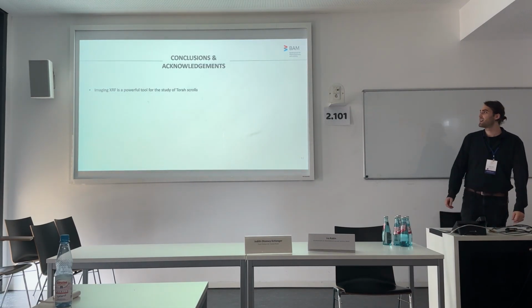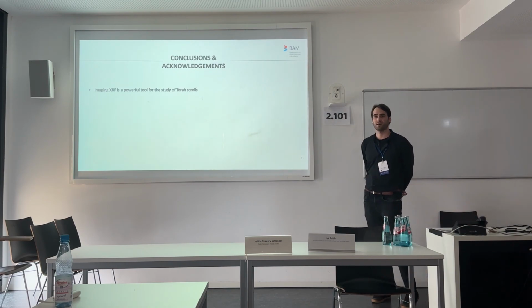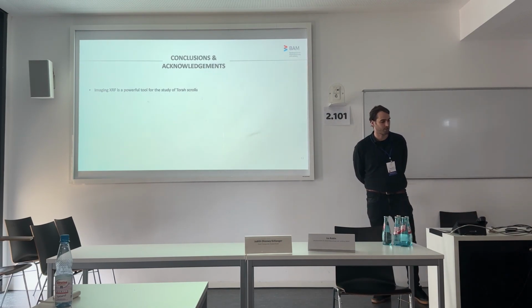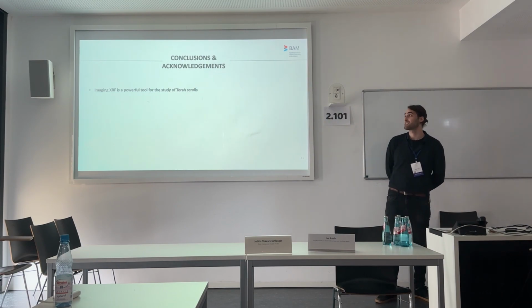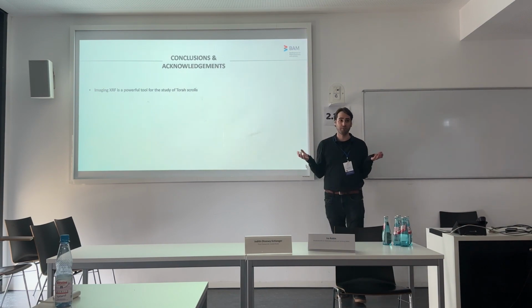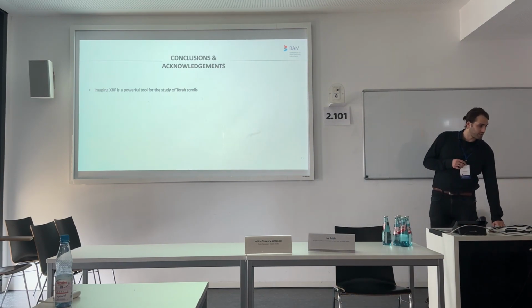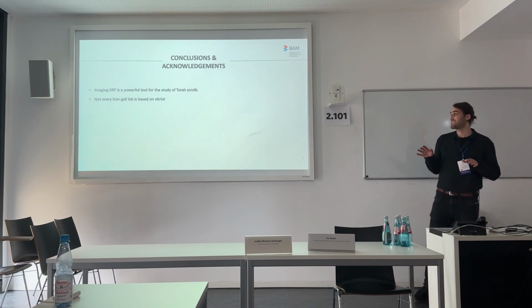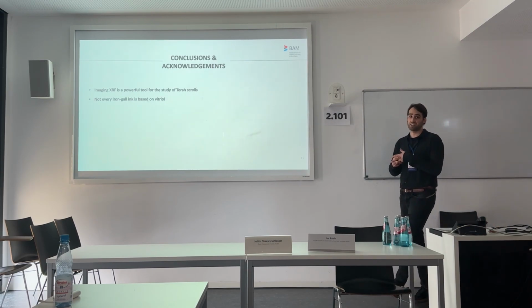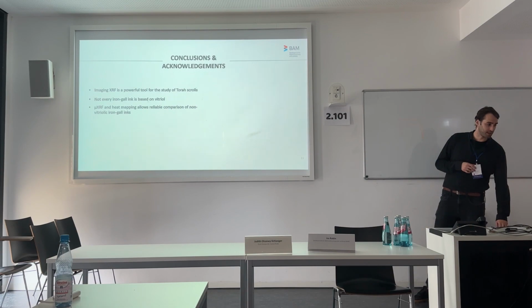To summarize my little presentation, I prepared a list of conclusions that I'd like to present to you. I hope I proved how imaging XRF is a powerful tool which can help answer different scholarly questions. Furthermore, I'd like to stress that not every iron-gall ink is based on vitriol, as we know now from the results of our investigation and also our studies of mock-up samples.